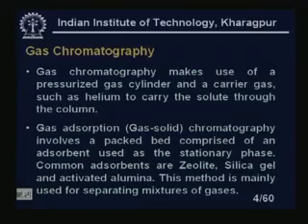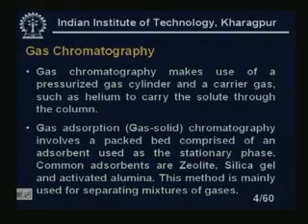Gas adsorption, that is gas-solid chromatography, involves a packed column comprised of an adsorbent used as a stationary phase. Common adsorbents are zeolites, silica gel and activated alumina. These are the most common adsorbents used in chromatography. This method is mainly used for separating mixtures of gases.